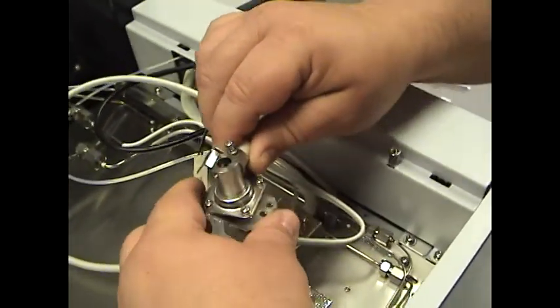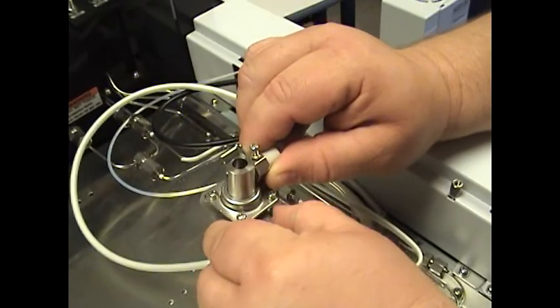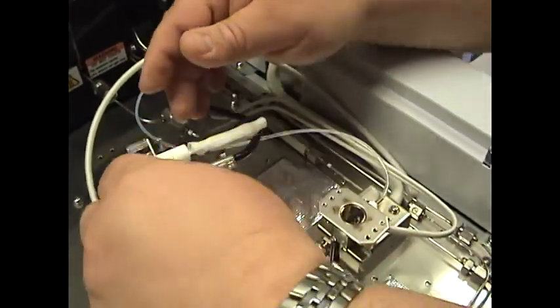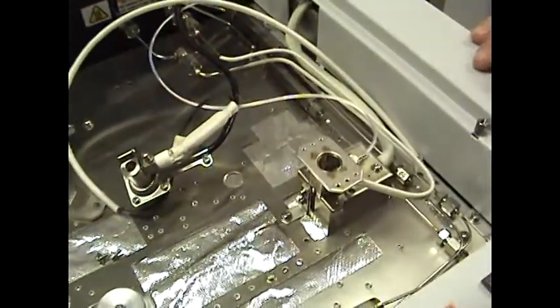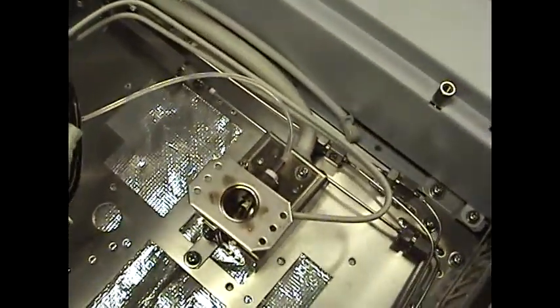The whole detector assembly will come out now. This plate also comes off — set that aside. Gently lay this aside. If you look down here, you can see the jet, but we can't take it out quite yet.